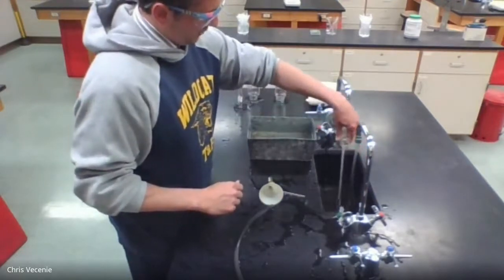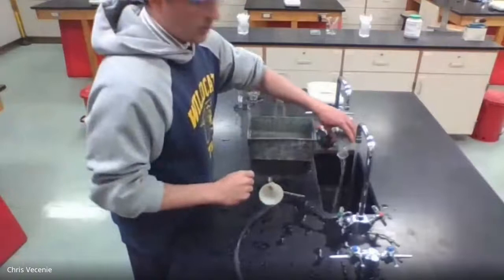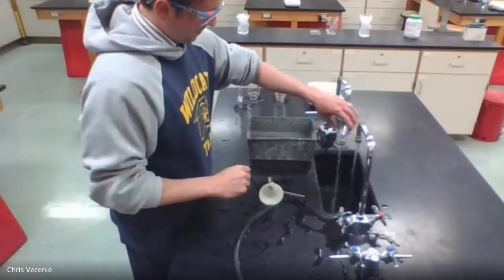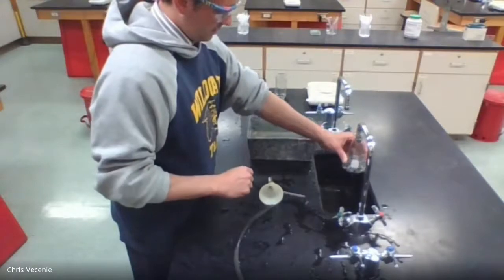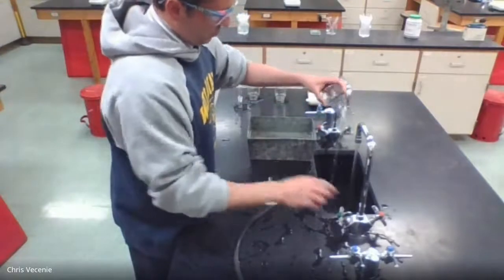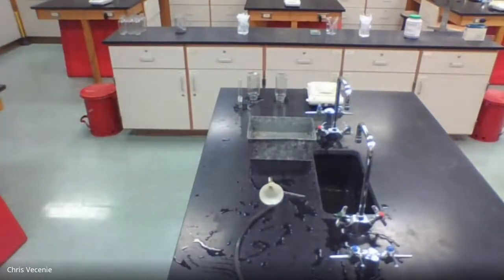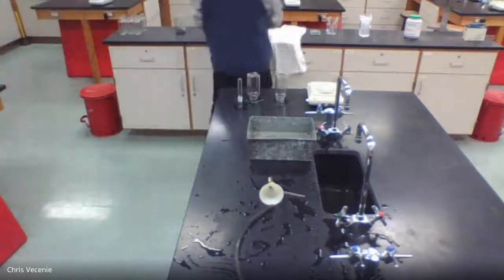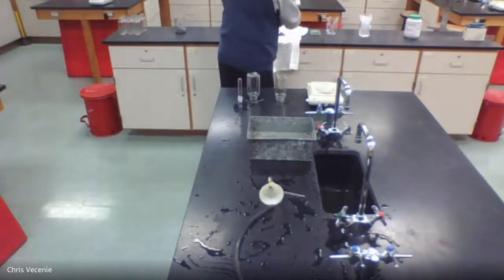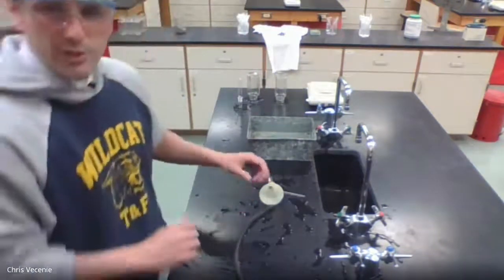Rinse my zinc rocks off a handful of times. We know good things are happening when it stops fizzing. And because I'm not seeing any more fizzing, what I'll do is I'll take my zinc back over to the middle counter. And we'll just dump the zinc in the middle where I can dry it later on and reuse it for another class.